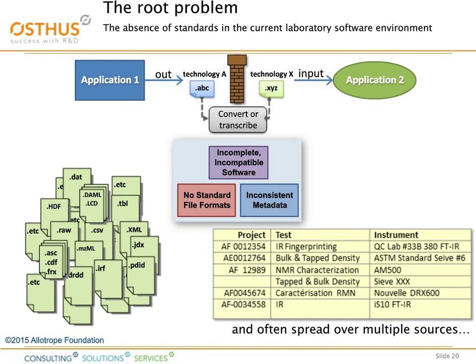So here you see a problem which almost everybody in the audience who has ever been in a laboratory can relate to and can recognize. When we do experiments, we use all types of instruments to gather our data, and all these instruments usually come with their own data format. If I want to take such an instrument file and put it into another application, if I'm lucky, I can read it in. If I'm unlucky, I have to convert it or I have to transcribe it. This results in errors, especially when you have to do manual transcription.